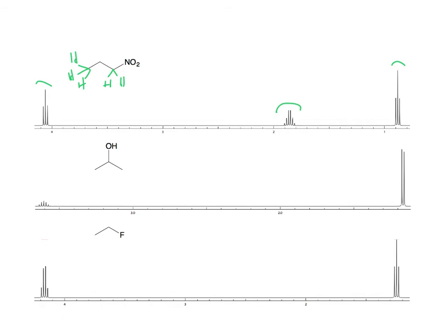That wouldn't look like that, right? I mean, it'd probably look a little bit more gross. Usually the one in the middle? The sextuplet, yeah. I don't know. It depends on how clean the sample is and everything. I can't remember if these are real spectra. I might have simulated them on a program.